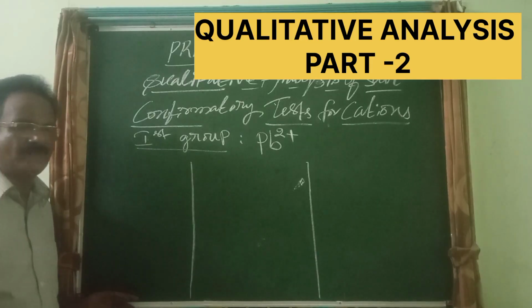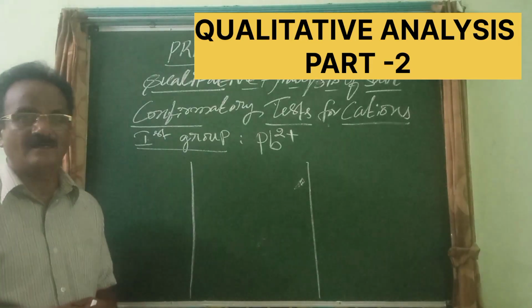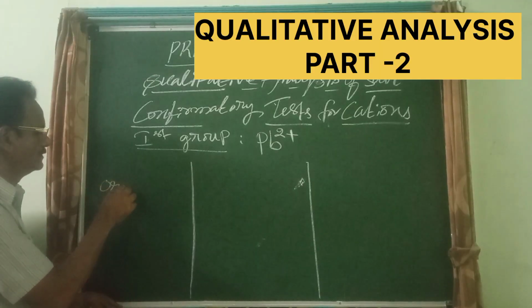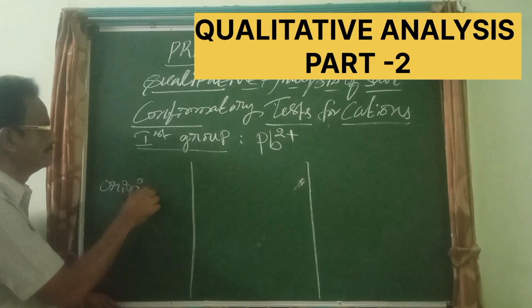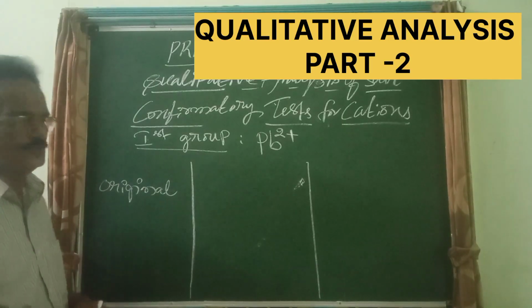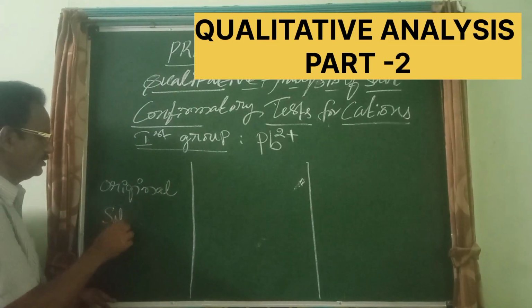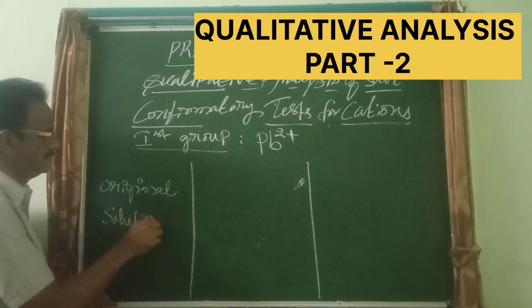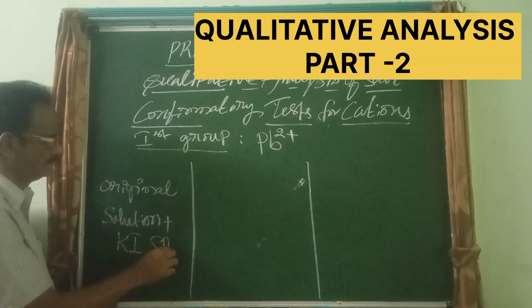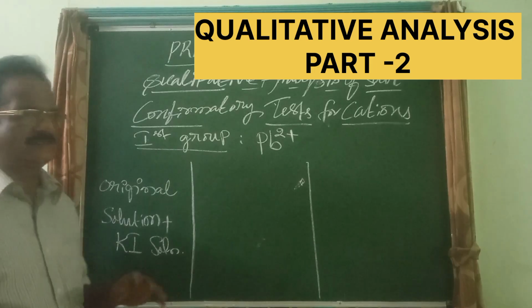The presence of lead is confirmed by adding potassium iodide solution to the original solution.